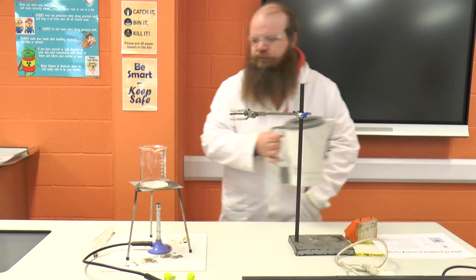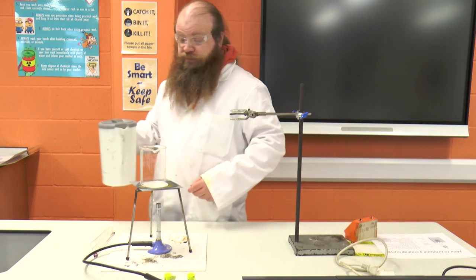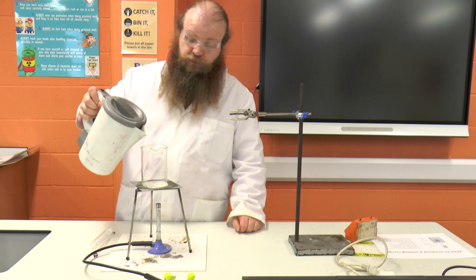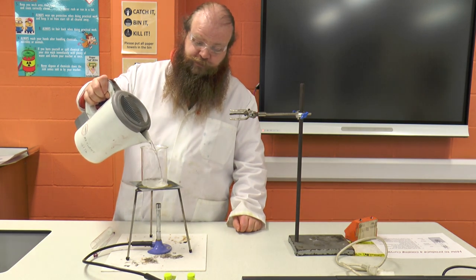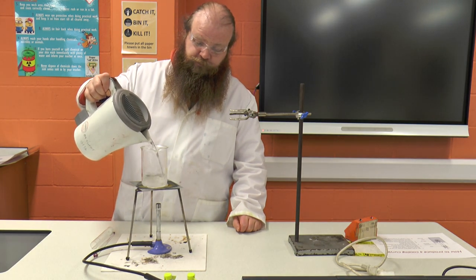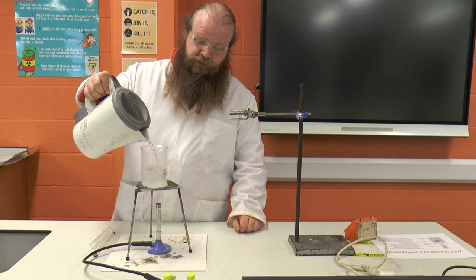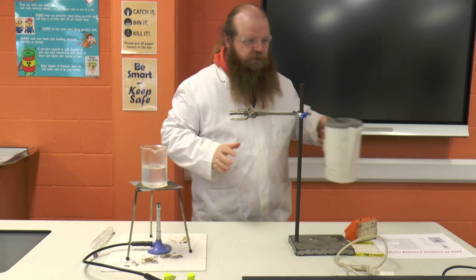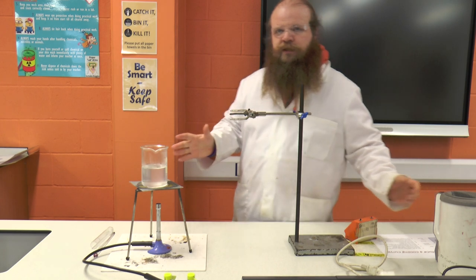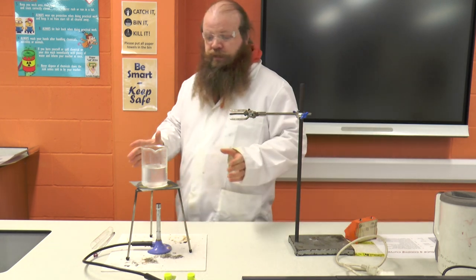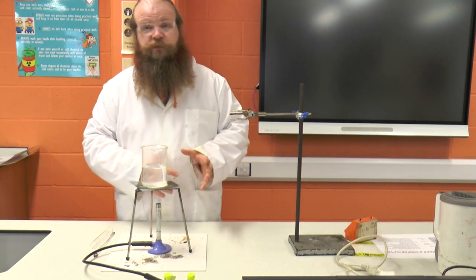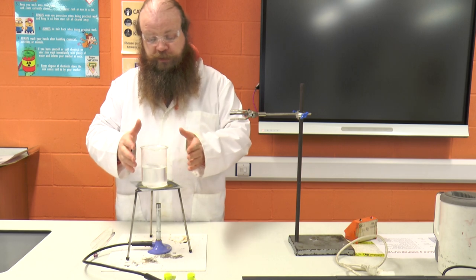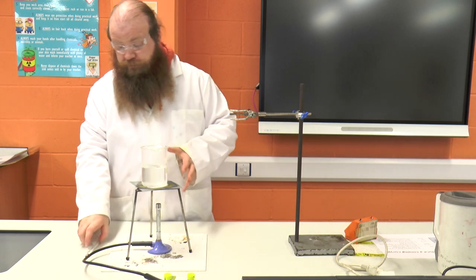What we're going to do is first of all put some boiling water into our beaker over our Bunsen burner — it doesn't need to be full. We need to be very careful when doing this because of the stability. We want to make sure that we can't knock it and that the beaker is sat on there properly so that we can't knock it off.